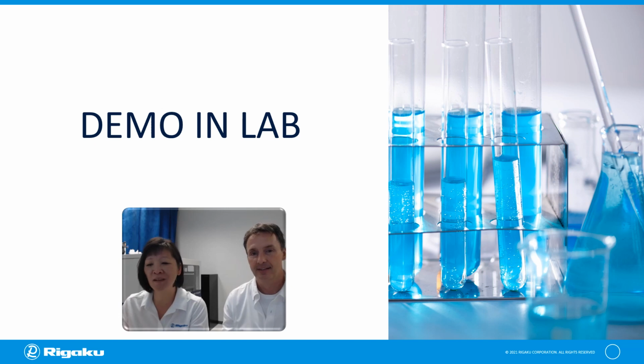So we're going to take you back into the lab and just show you representative ways of how we prepare things. And then after that, we're going to come back, and I'm going to do all the talking. No, we're going to come back and show you at the instrument. We're going to do an application together. We go through all those steps we just talked about and show you how easy it is, and then how you would just set up samples, in perpetuity. The analyses that your chemists are going to walk up and run on the system.